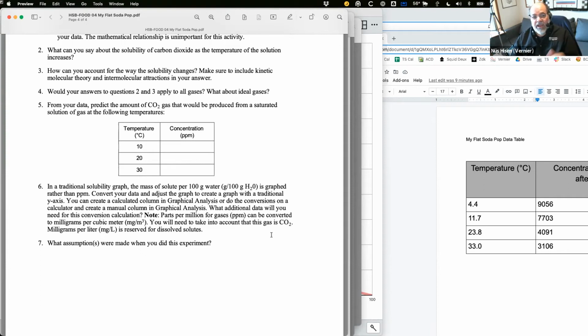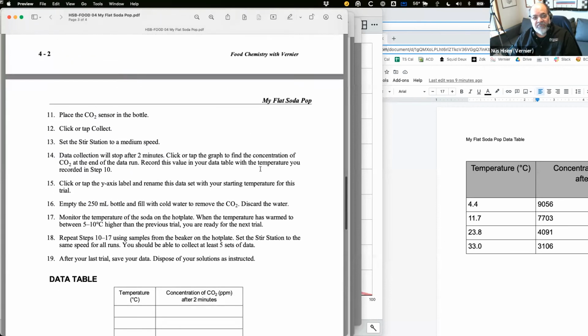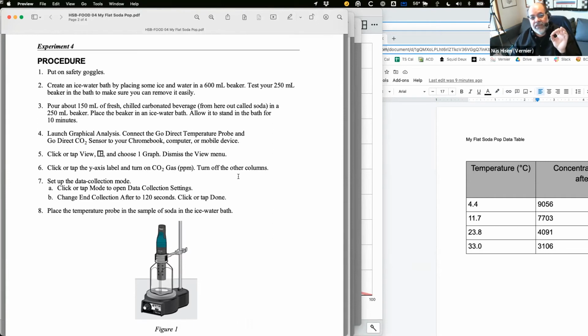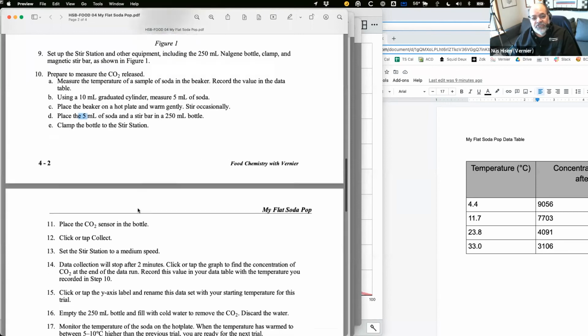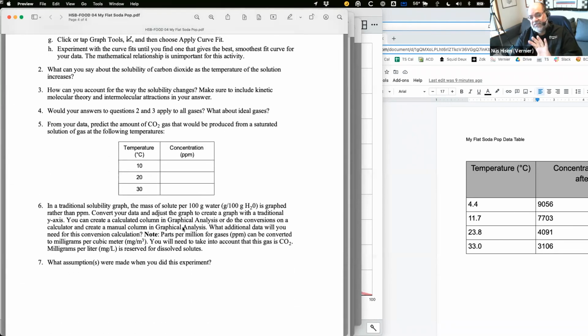And then if you go back and look at the original, the way I ran this, I ran it with 5 milliliters of liquid every single time. So the mass of carbon dioxide that we measured, we're making a small assumption that it all came from that 5 milliliters of solution that we started with. Where's the 5 milliliters? It's right here. Okay. And so this is kind of a neat way to start combining some concepts here.